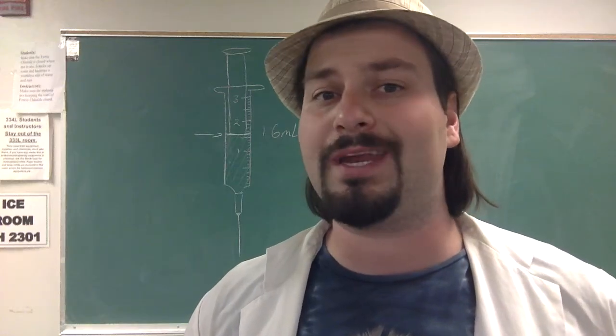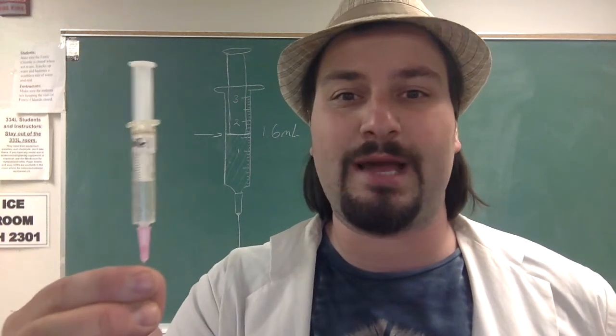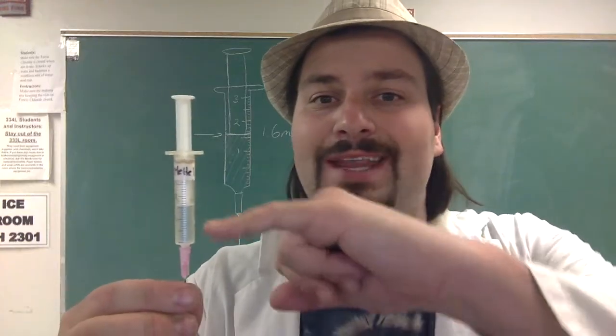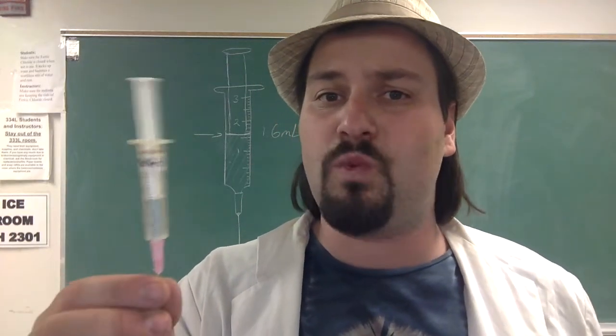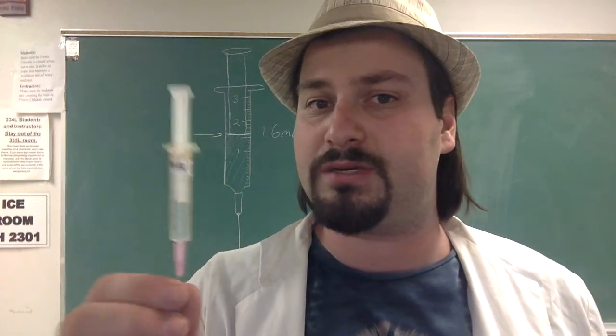When you're measuring both the bromobutane and the acetone, you'll be using this type of syringe. With this type of syringe, you want to make sure that you get the surface of the liquid to whatever you want to measure. For the bromobutane, that's 1.6. For the acetone, it's something else, so make sure you've got that right.